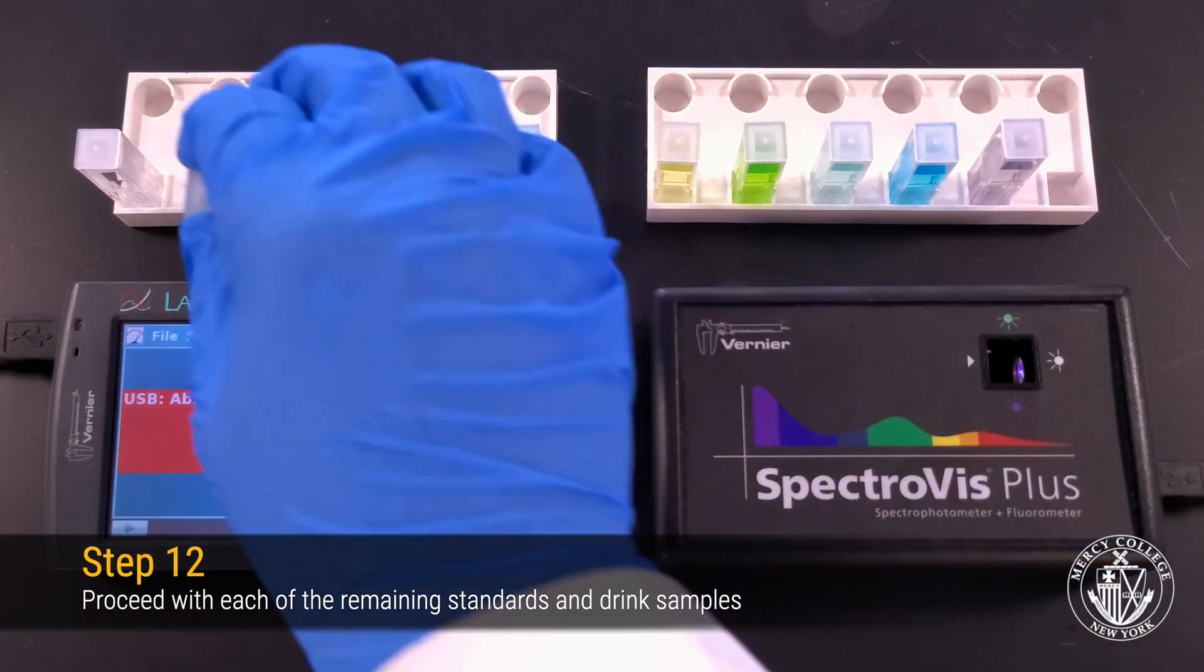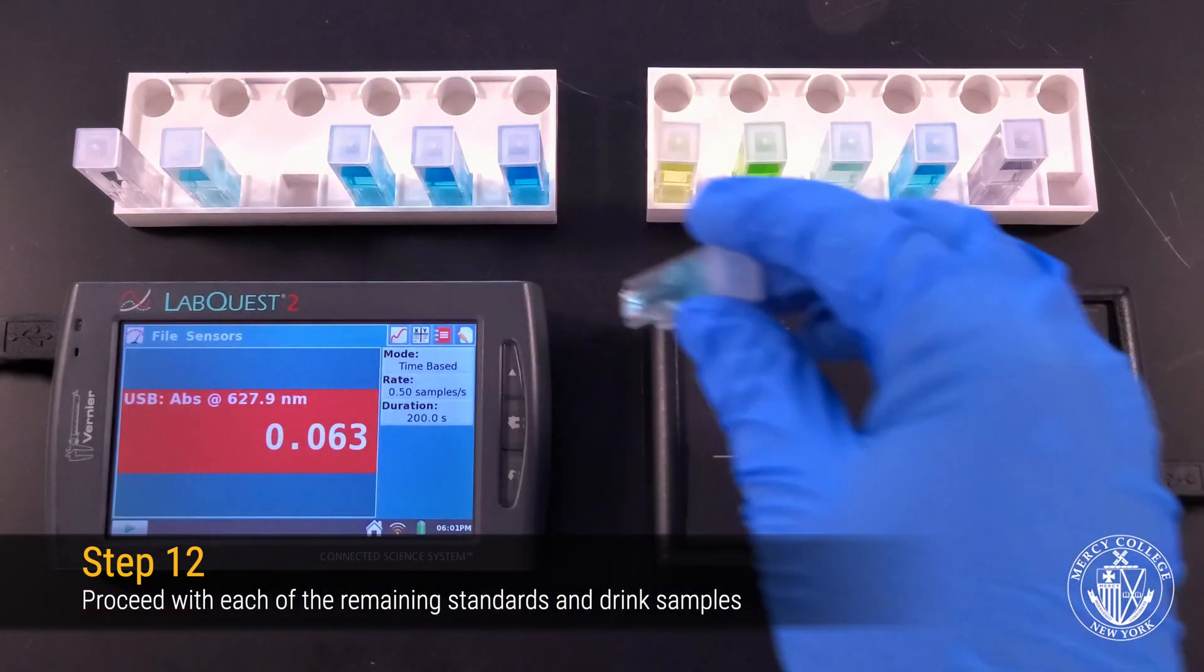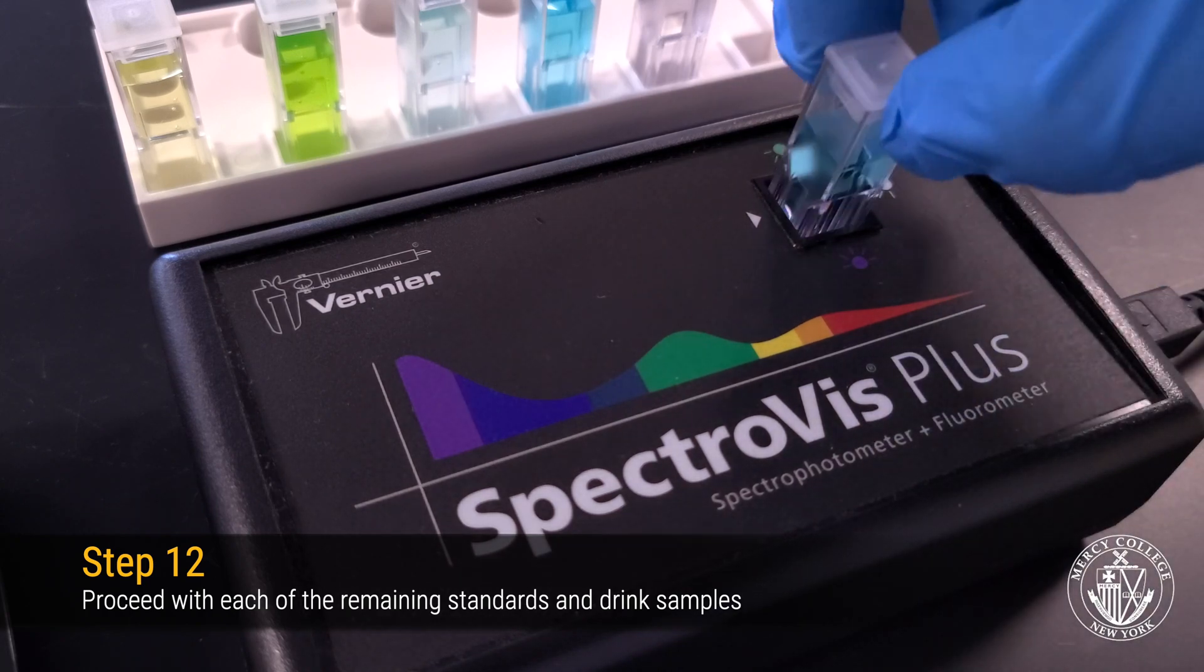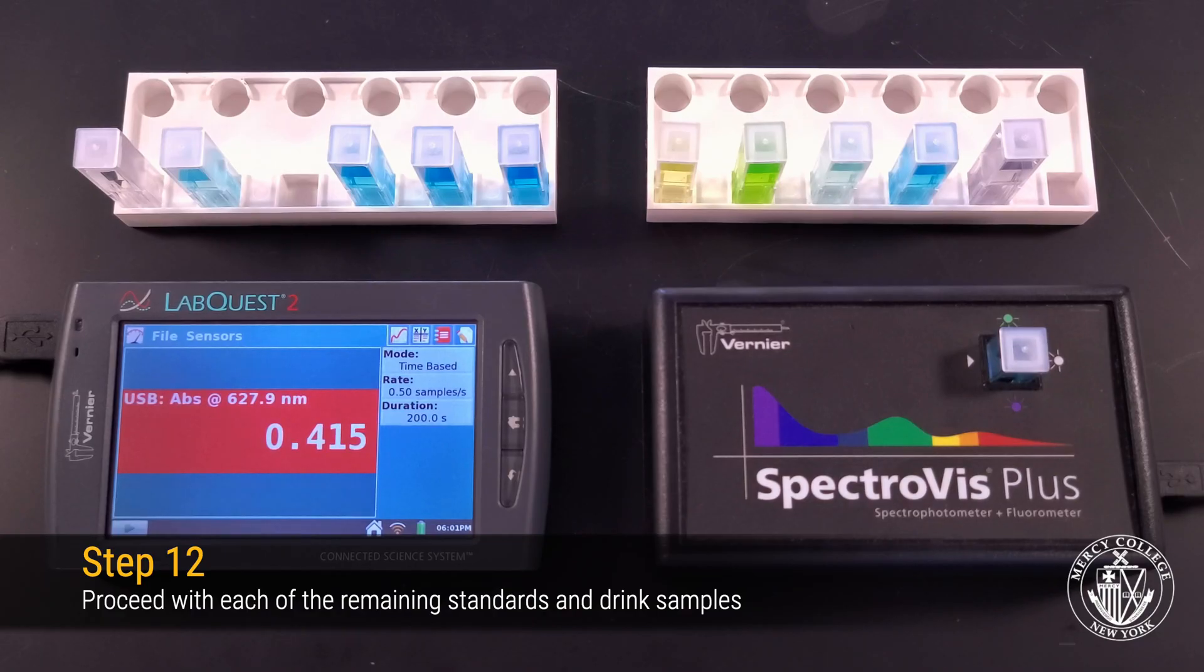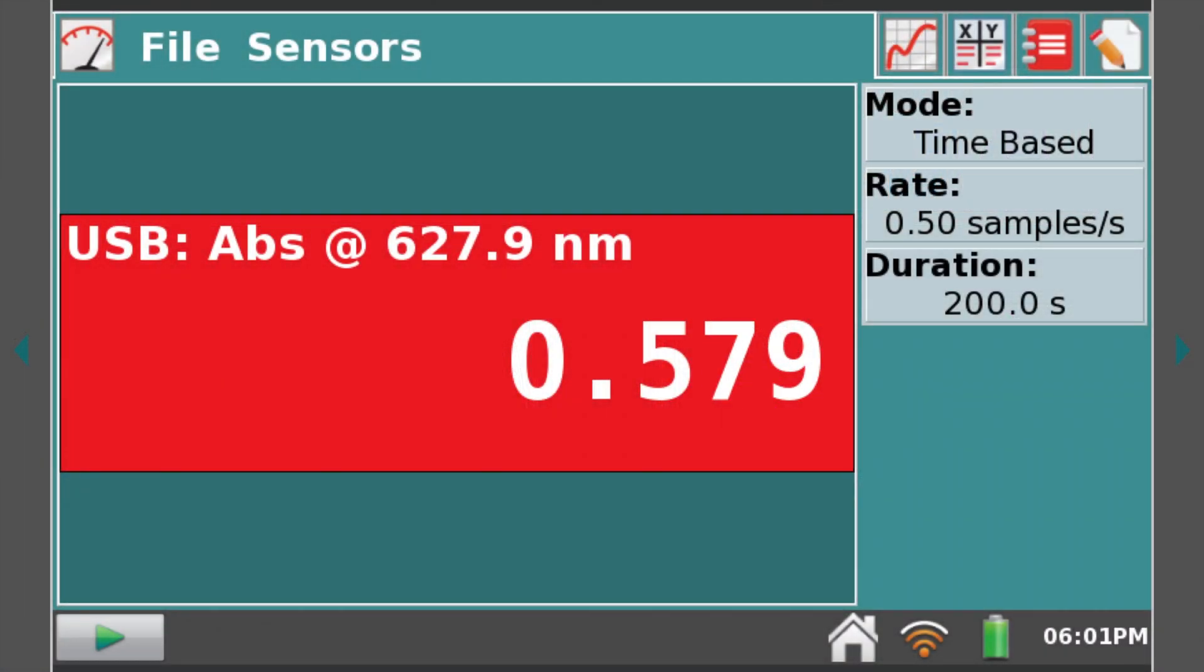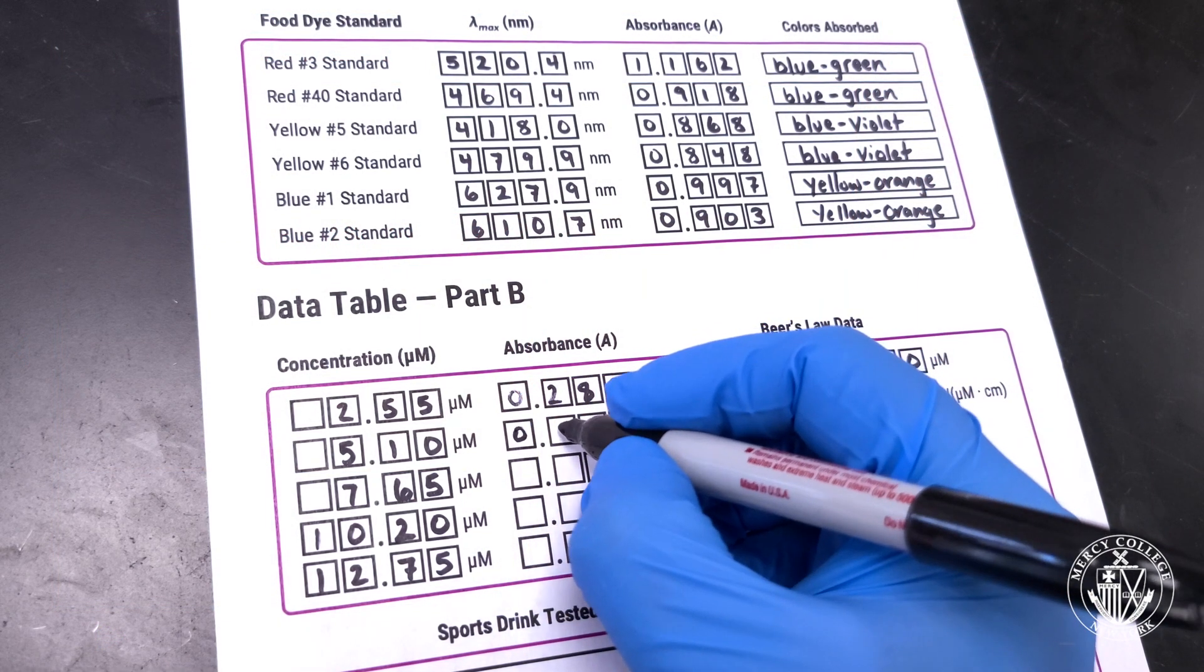Repeat the process for your remaining dye standards working from the most dilute to the most concentrated sample. Wait for the reading to stabilize and record the value on your datasheet. Our second standard appears to have an absorbance of 0.580.